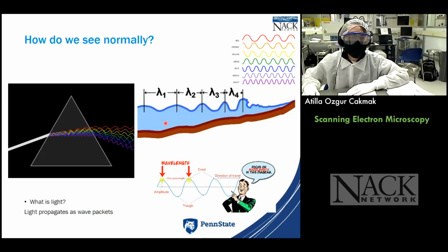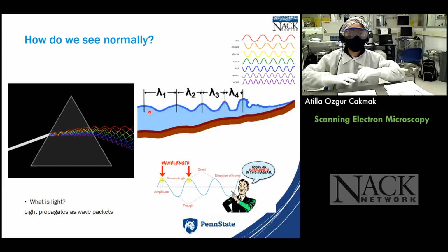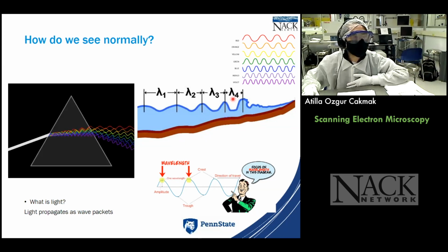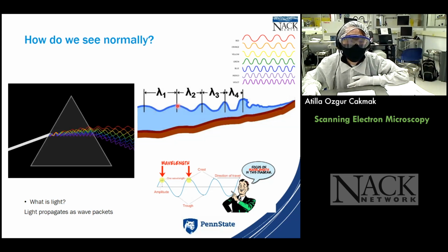And when we're talking about waves, when I teach it to my students, even at the graduate level here at Penn State, I always like to use this simple picture, because that's the first thing that comes to people's minds when I talk about waves, right? The ocean waves. They're different physics, of course, but there is something quite important here that I would like you to remember. That's the Greek letter lambda. Most of us already know about that, but it signifies the wavelength. This peak-to-peak separation between the peak positions of the wave itself designates lambda, the wavelength, okay?